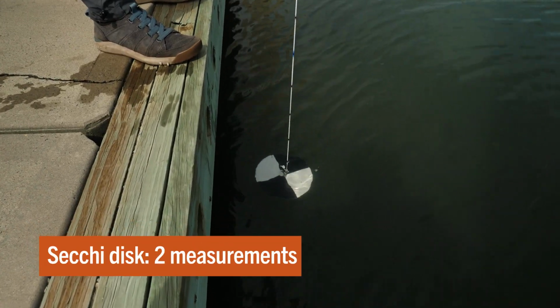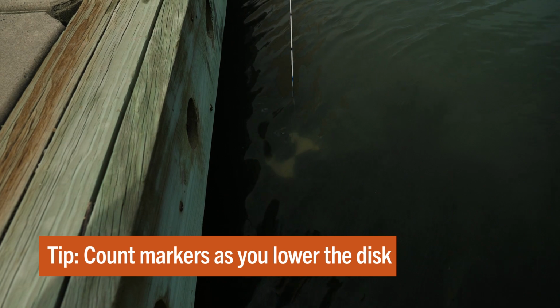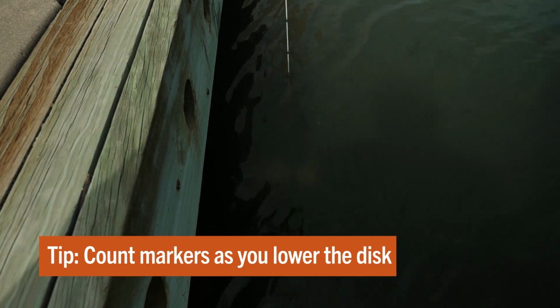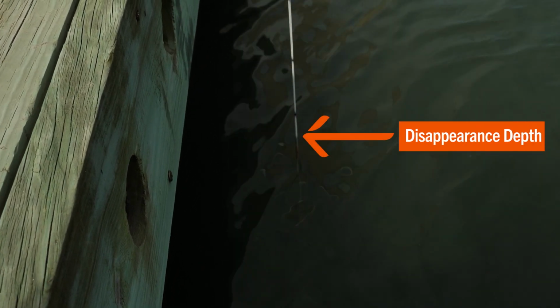You'll take two measurements with the Secchi disc, one as the disc is being lowered and one as the disc is being pulled up. Holding onto the rope and looking straight down at the Secchi disc, slowly lower the disc into the water. As soon as the black and white quadrants become indistinguishable, stop lowering the disc and record your measurement on the rope where it meets the water surface. This is your disappearance depth.